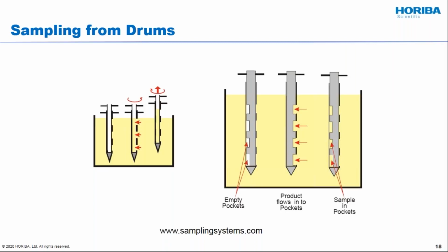In other words, at some point in the process, you were actually doing the filling of the drum, the filling of the bag, things like this. That would really be the point where you ought to do a proper sampling. And what you want to do is, as you're filling this drum or bag or rail car, whatever it might be, every so often you want to take a small fraction of what's going into the container.